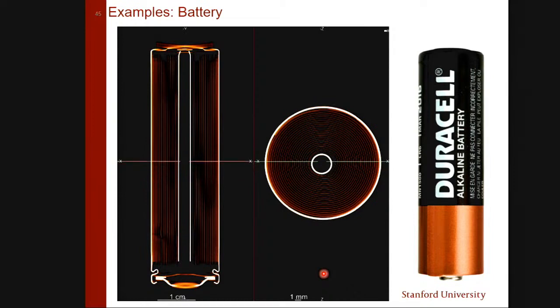And these type of batteries are used in the Tesla cars, right? Not Duracell, but that size. So they pack a lot of these small batteries. And they come to us also measuring this kind of properties. I think they now have their own instruments, so that's what you can do.